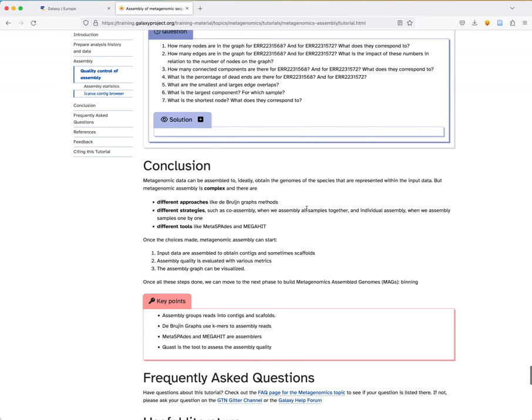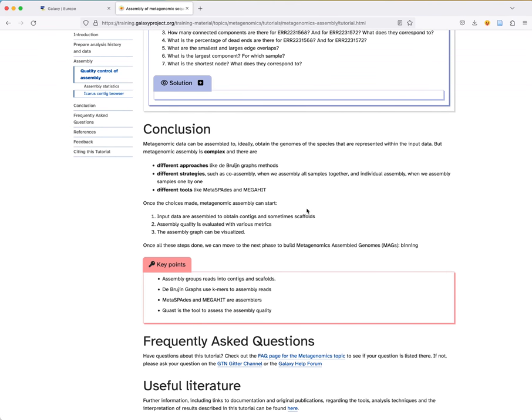Another thing you can do is visualize de novo assembly graphs using Bandage, with an explanation in the tutorial. We did it and you can see all the contigs combined — there is a long contig and different contigs branching from it. We are at the end of this tutorial. I hope you learned about metagenomic assembly, the de Bruijn graph approach, different strategies like co-assembly and individual assembly, tools like Metaspades and MEGAHIT, and how to assess assembly quality with MetaQUAST. Once you're satisfied with the quality, you can move forward to the next step such as binning. Thank you!